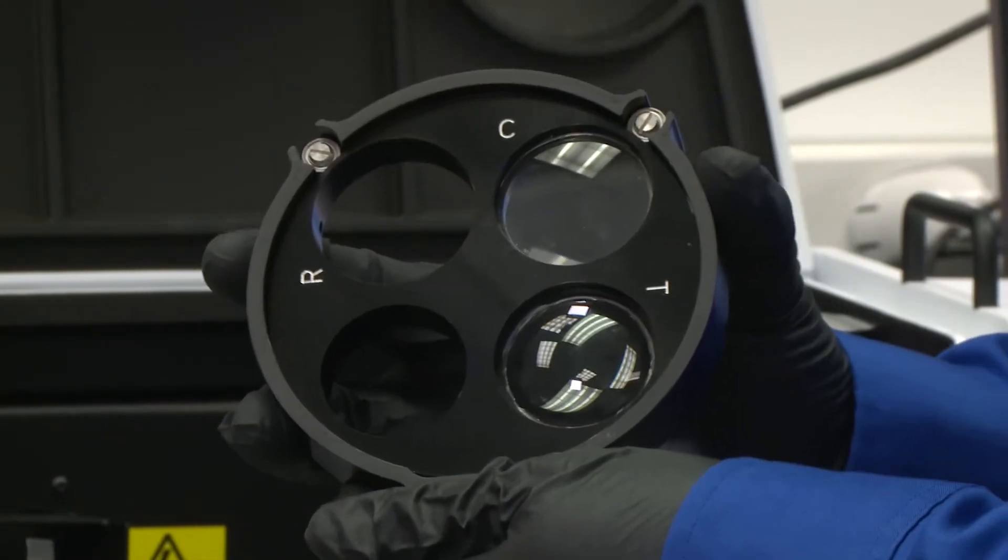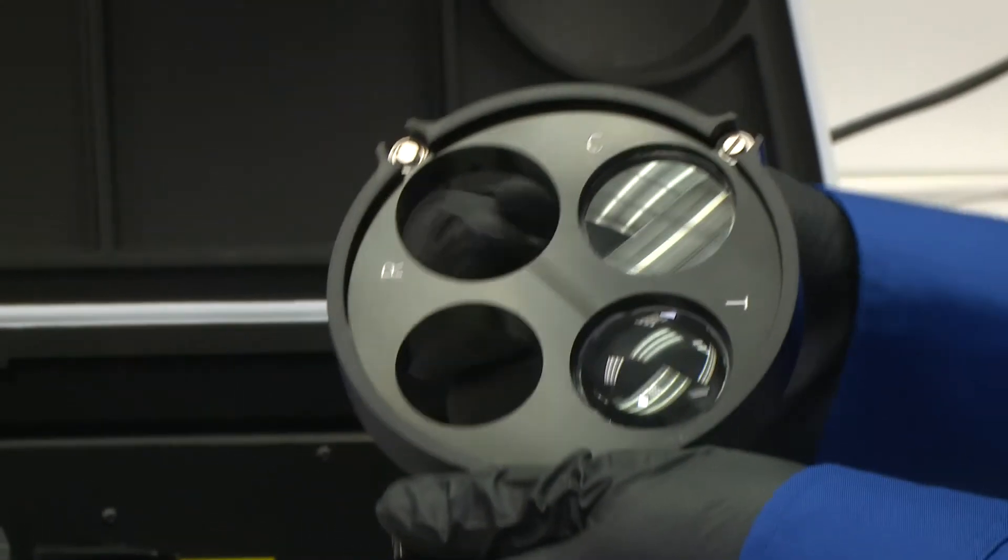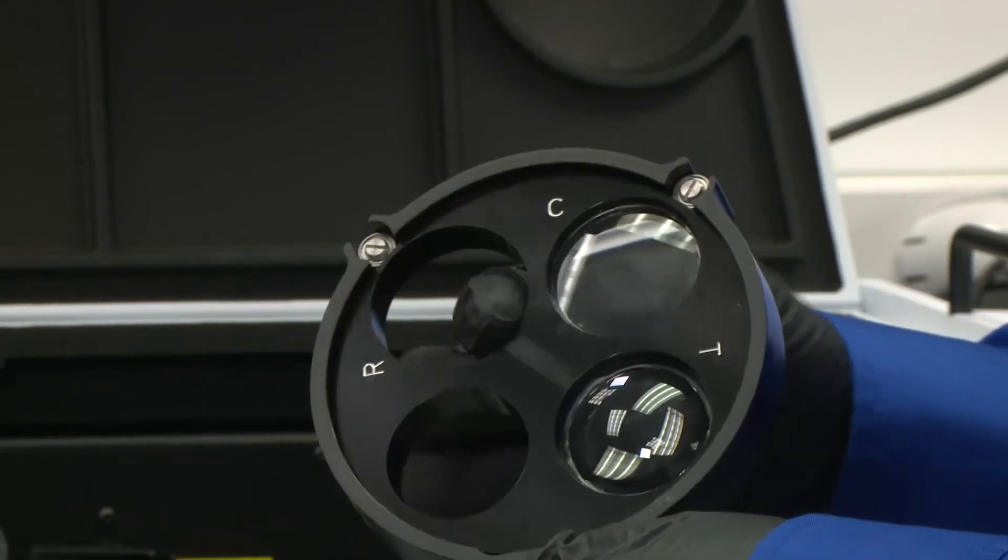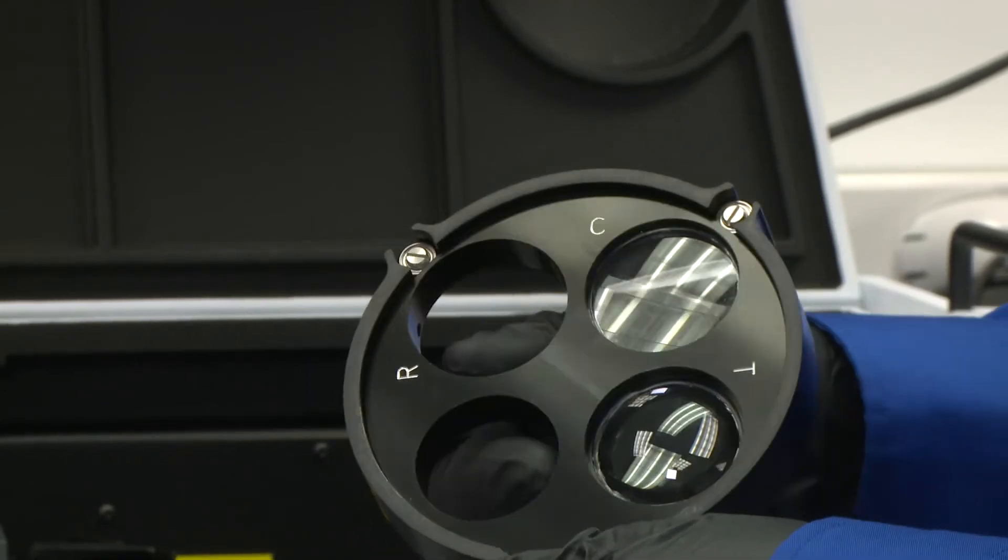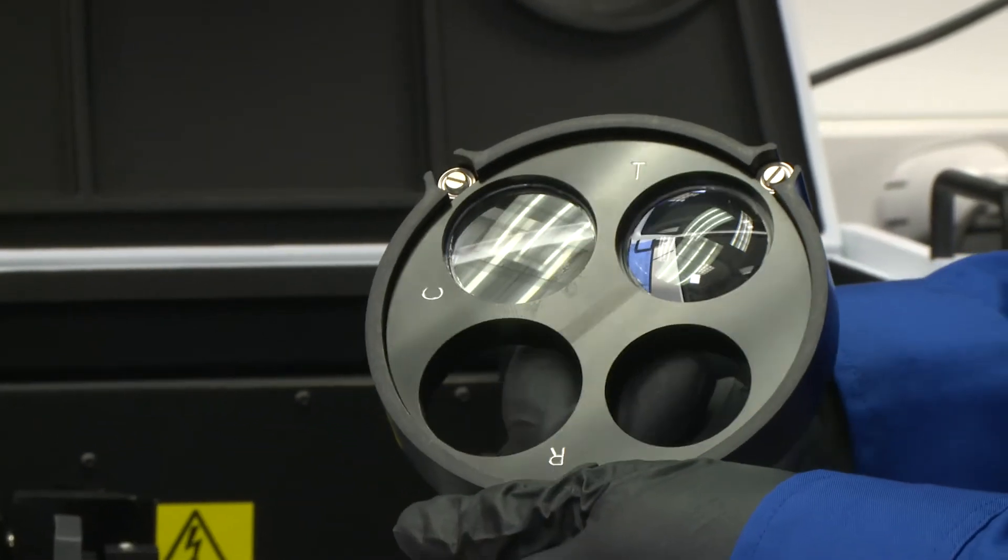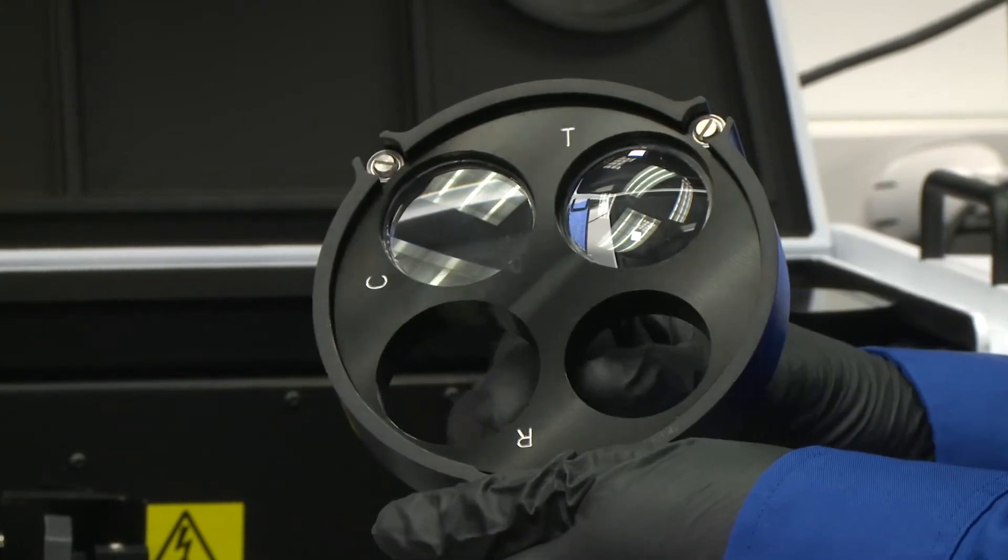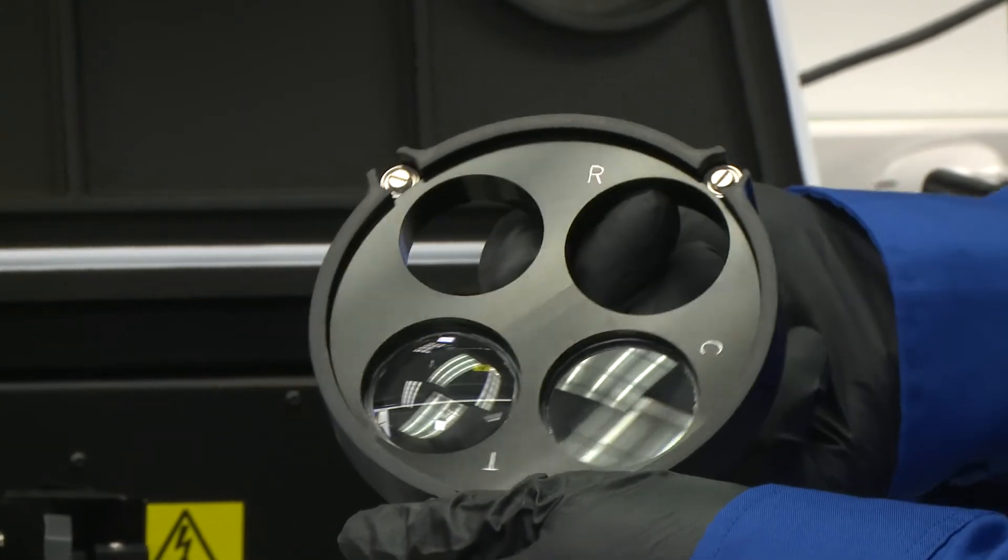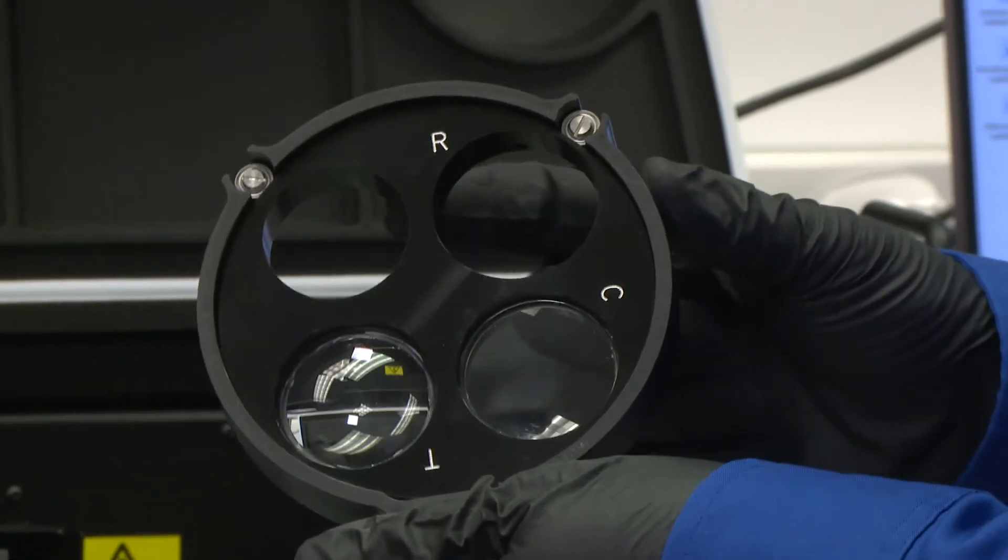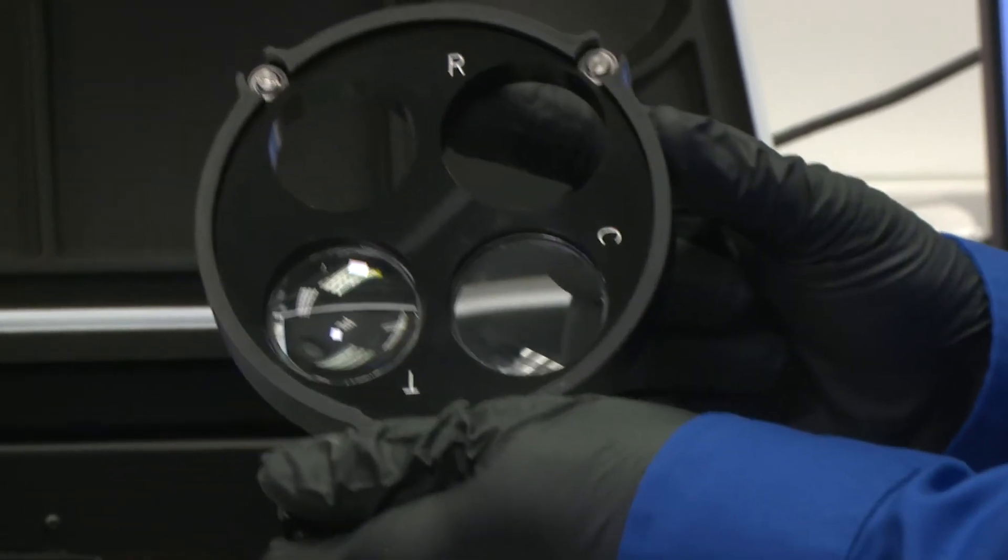And there are four locations. One is marked C for the centre mount location. One is marked T for the transmittance port location. And the other one, which currently does not have a focusing lens, is R for the reflectance port.